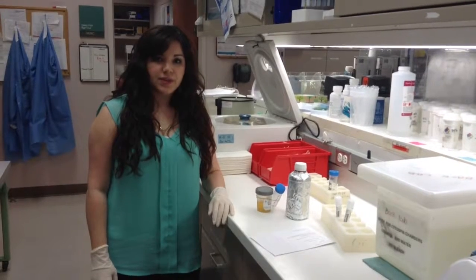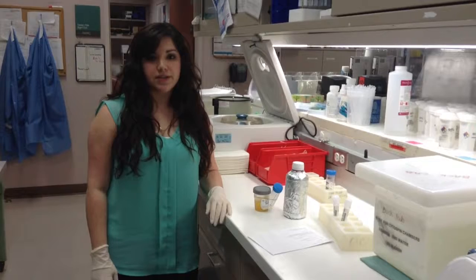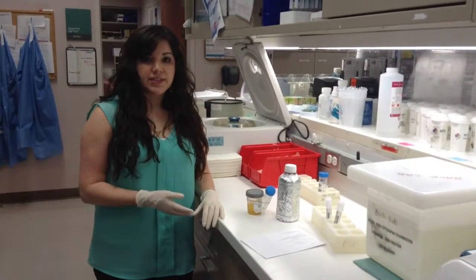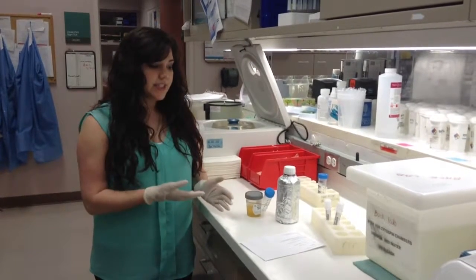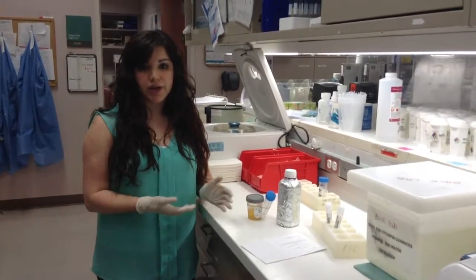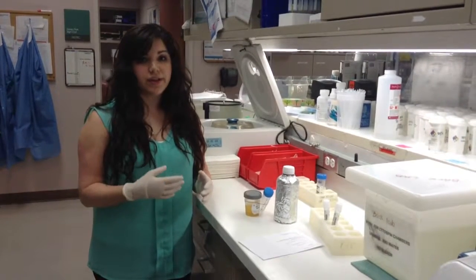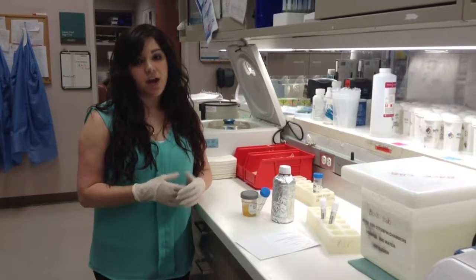For day 2 of the summer rotation, we would like to outline for the student how to process specimens in which we will not be smearing the slide. It is important on this day to emphasize the purpose behind not smearing. For example, with CSFs, it's a sensitive area to collect from the patient, and with urines, the specimens are typically a bit more scanty than other specimens.